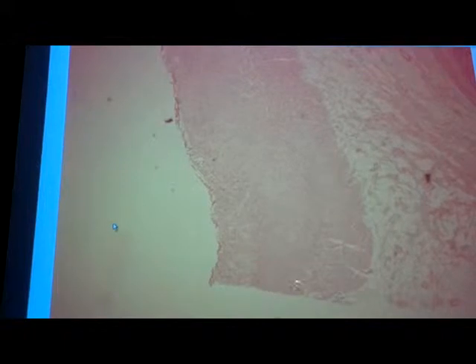This is muscularis externa. This is submucosa. Submucosa is a very loose connective tissue. You should be able to make out 3 layers of muscularis externa. I can kind of make it out. You see there's a division line here? I always go to the end because at the end is where the tissues kind of break apart. It's a cheating way to figure out what's what. So which one's the innermost? The oblique layer.